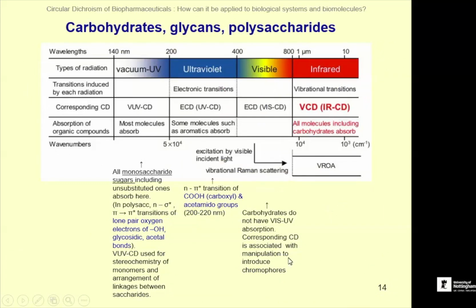Finally, polysaccharides. Can we usefully use CD for polysaccharides? Steve's favourite subject? Well, you can, but you're looking not just in the far UV, certainly not the near UV. We're looking in the vacuum UV region, ultra low wavelengths, to be able to see carbohydrates and polysaccharides. Some of the monosaccharide sugars you can see in this region, and indeed polysaccharides, as I've said.